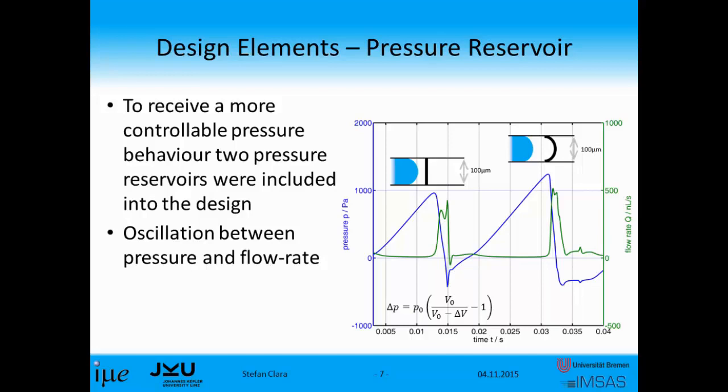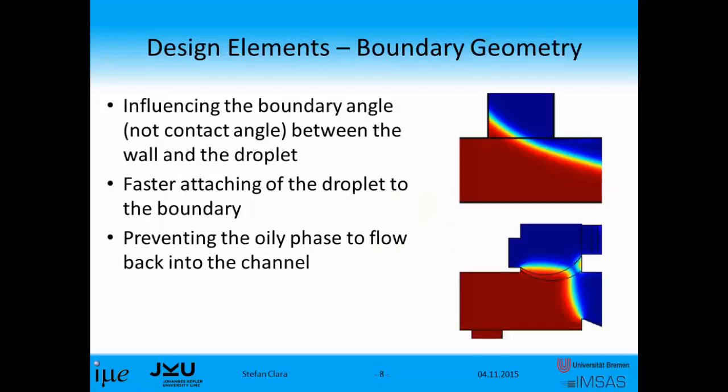That means we now have an oscillation between the pressure and the flow rate in this device.